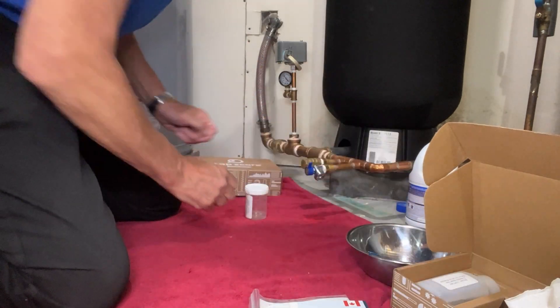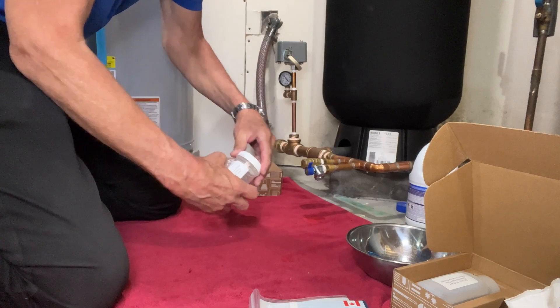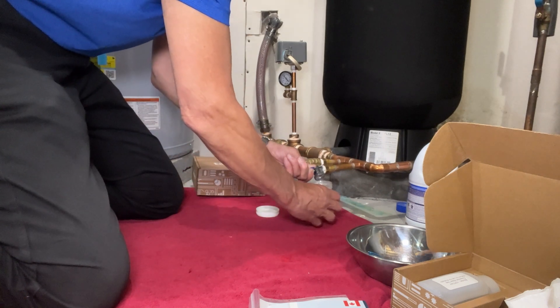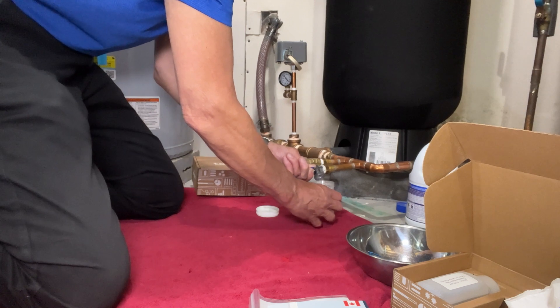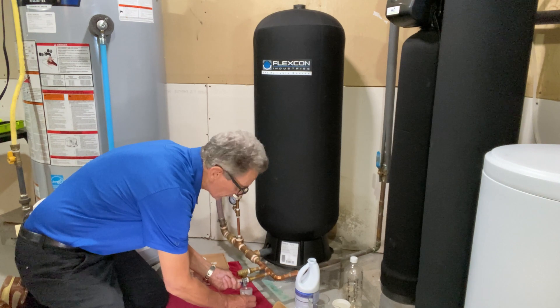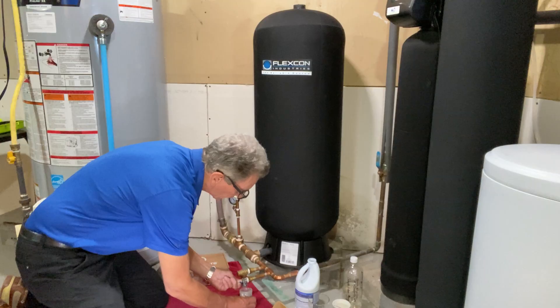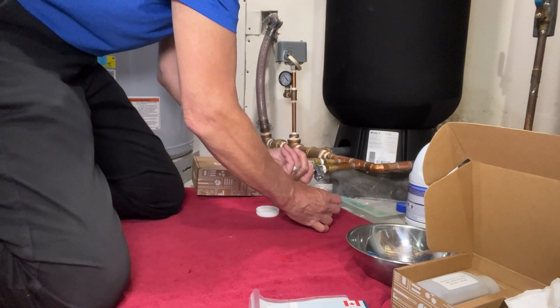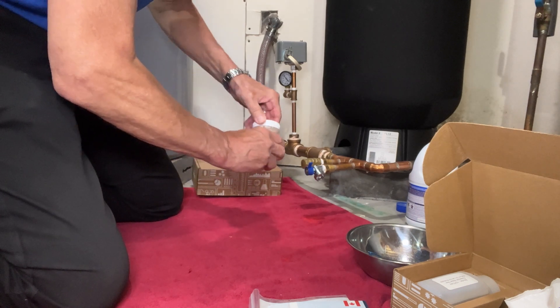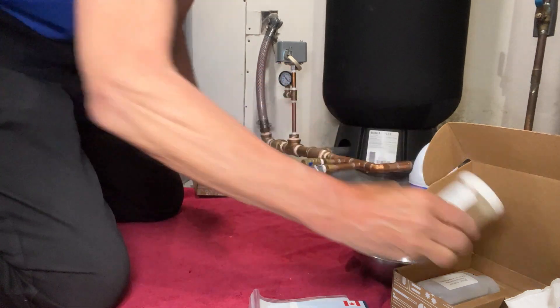For the second bottle, open it up — you can see there's a tag on it that says it's sterile. Set the cap aside and fill it up, again filling slowly to introduce less air. Close it up and make sure it's closed tight, then it goes back into the box. This kit also includes a hydrogen sulfide test to test for that rotten egg smell in your water, and it includes two parts.